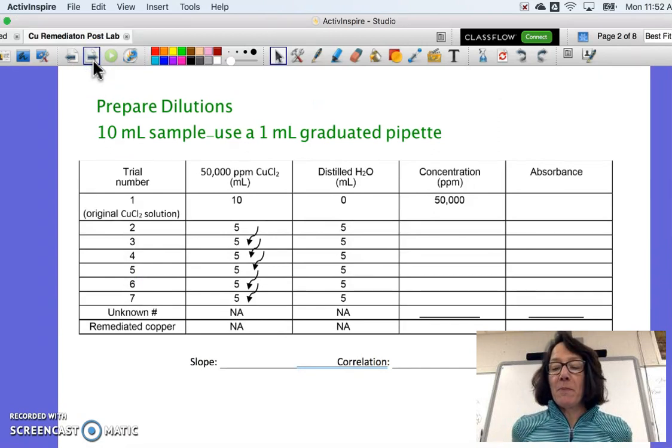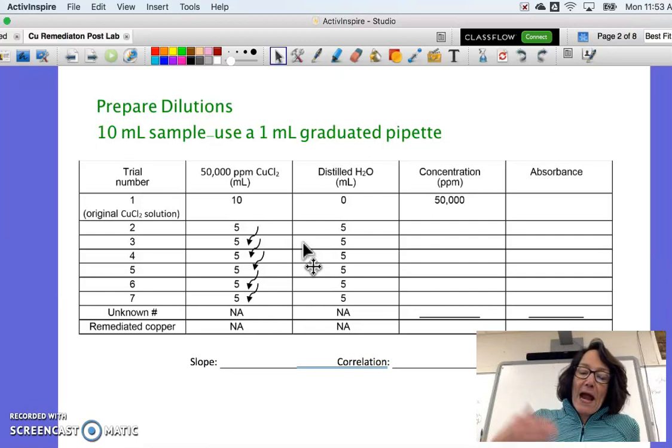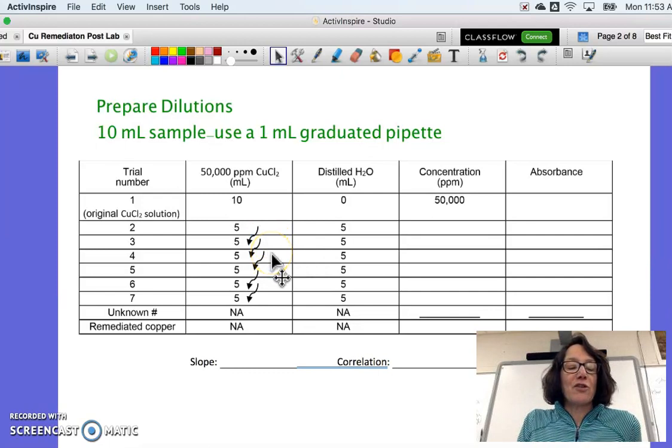In the first part of the lab, you'll be performing a dilution and testing that diluted concentration in the colorimeter. So you notice that you start with 10 milliliters of the original 50,000 ppm solution. You're going to take 5 milliliters of that and add 5 milliliters of water, and you will end up with a 25,000 parts per million solution. You're going to continue that. I'm going to take 5 milliliters of the previous concentration and add 5 milliliters of water. You always want to make sure that you mix your new test tube of solution really thoroughly before you take 5 milliliters of that to the next test tube and dilute it down.